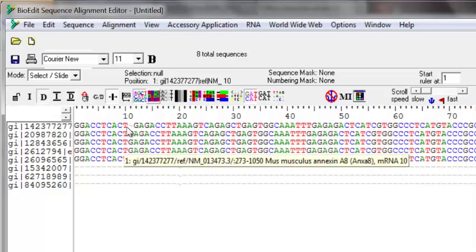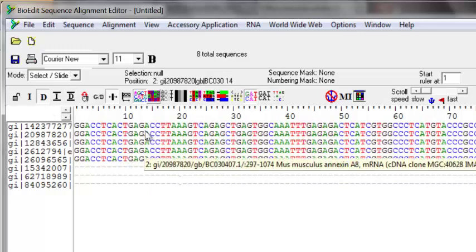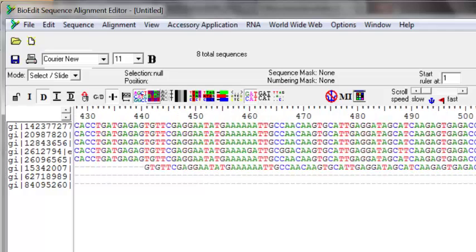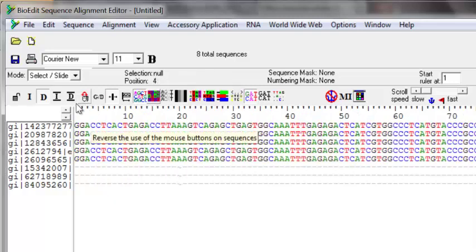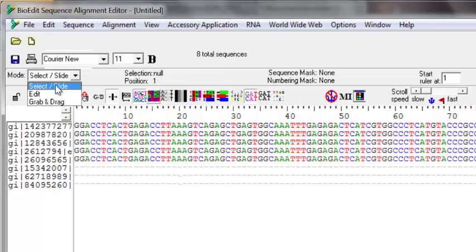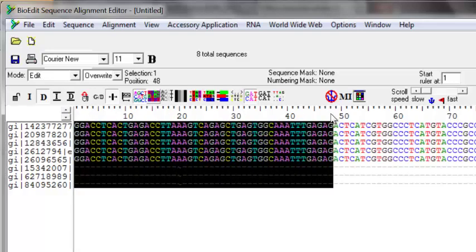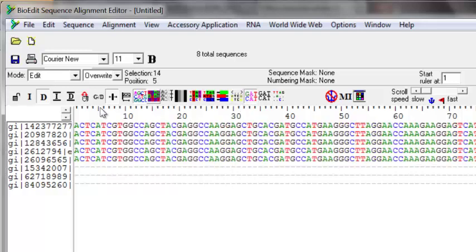At some point you might want to delete a region in the alignment — for example, when you are trying to find a conserved region and there are areas which are not conserved at all. You can do that by selecting the sequence and deleting it, but first you have to change the mode to edit mode, otherwise it won't let you delete anything. Once in edit mode, you can select a region you want to delete and just press delete on your keyboard.